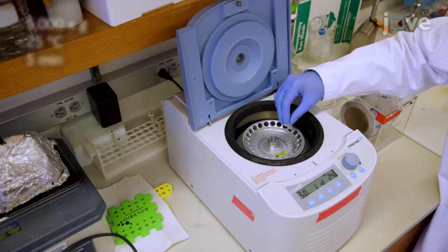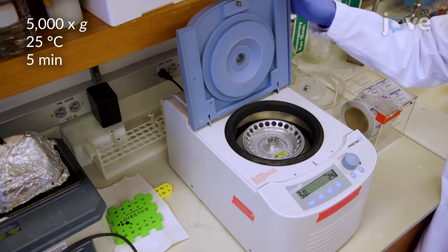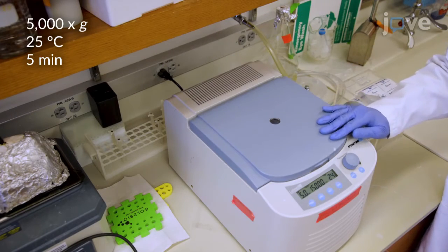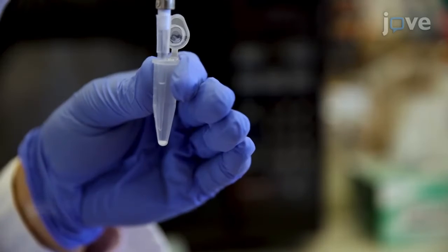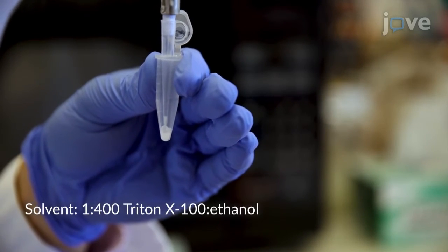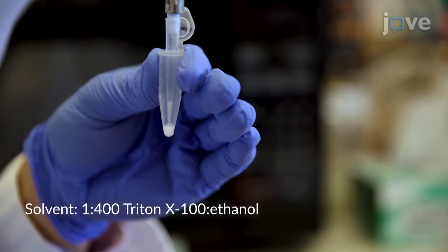Centrifuge 50 microliters of 1 micron non-functionalized polystyrene beads. Discard the supernatant, leaving as little water remaining as possible. Resuspend the beads in 50 microliters of solvent, then mix thoroughly by pipetting.